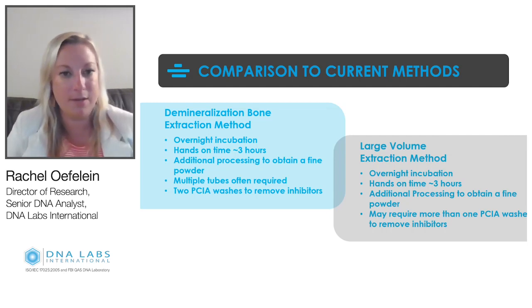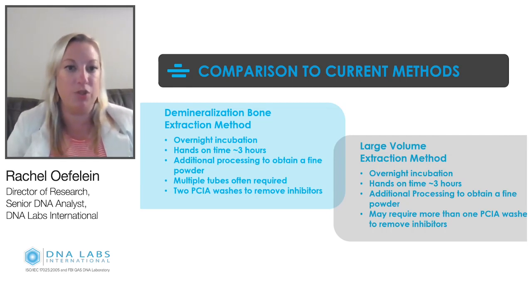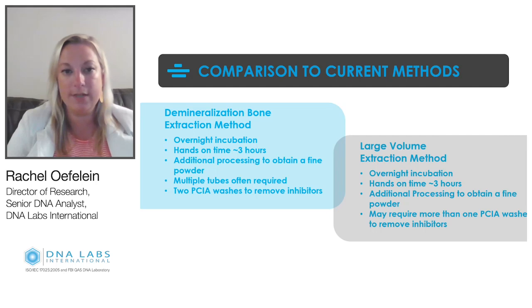The other thing that's important to mention here is that we have multiple tubes required. So we're doing multiple phenol washes, and because you have multiple tube transfers, you're exposing yourself to the potential for a contamination event. So we want to limit our tube transfers as much as possible. And we also brought online a large volume extraction method. That involves a butanol wash as well. And instead of being performed in microcons, we're now in Ultra-4s. And this whole process was actually brought online specifically for genealogy.